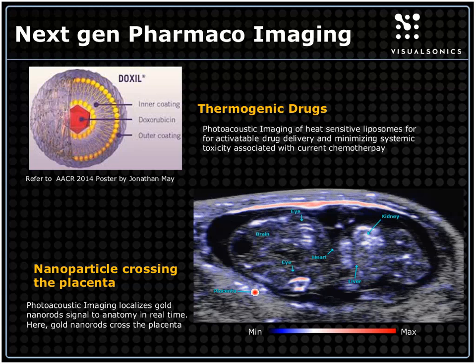There is some nanoparticle in the placenta, and it has crossed the barrier because I do see the signal or color intensity pass and go into different parts of the embryo, including the eye, some into the heart, kidney, and perhaps some in the liver.